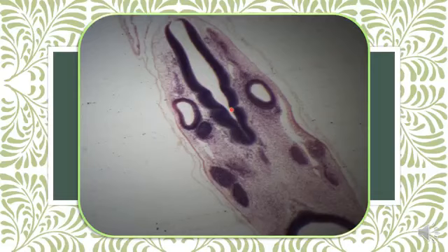You can see this is the neural tube on that side and another neural tube on the other side. This is the diencephalon and this is the myelencephalon, neuromeres of myelencephalon. Also in the transverse sections you can see the ear vesicles or otic vesicles, otocysts.